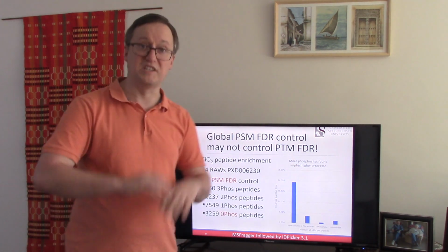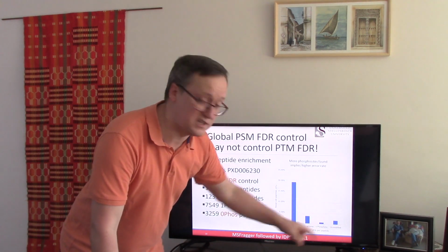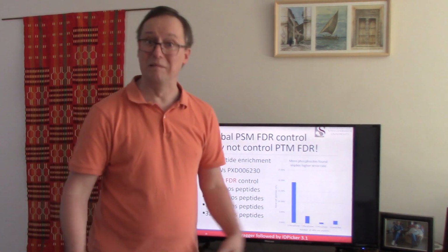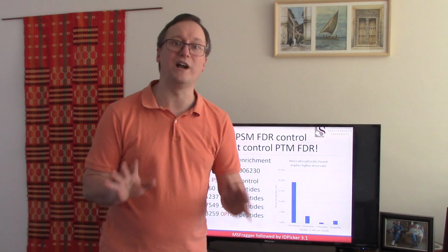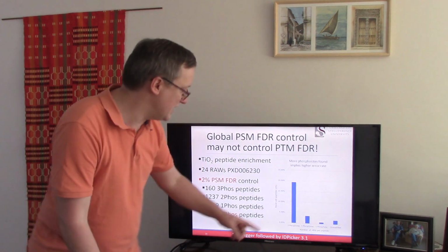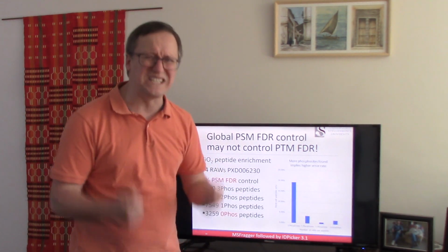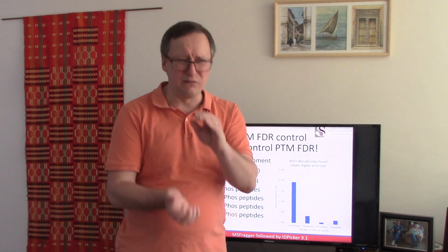Now the most common set of peptides were those that had 1 phosphorylation. When I look at those singly phosphorylated peptides, I see that their error rate was even lower than the unmodified peptides. So that's really good news, I think. We can trust these 1-phosphate identifications to a very high degree. But look what happens when we look at the peptides that had 2 phosphates on board, or 3 phosphates on board. The error rate among the 3-phosphate bearing peptides is almost as high as 20%. 20% of the 3-phosphate peptides could only be explained by a reversed peptide. We know those are false.